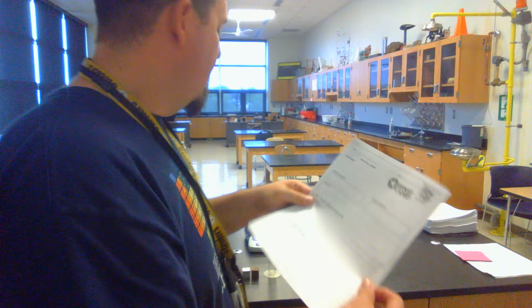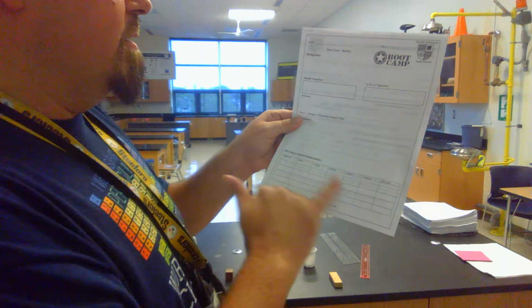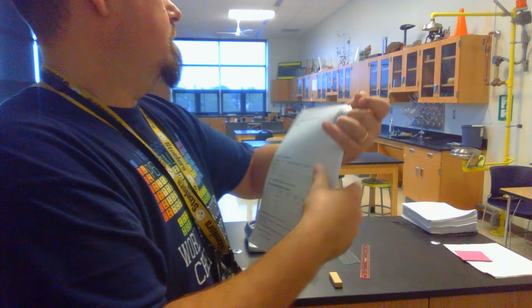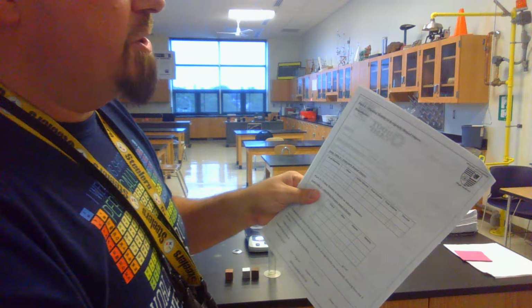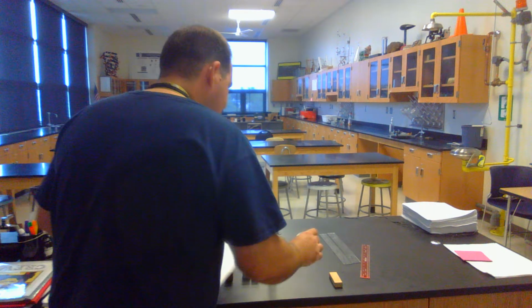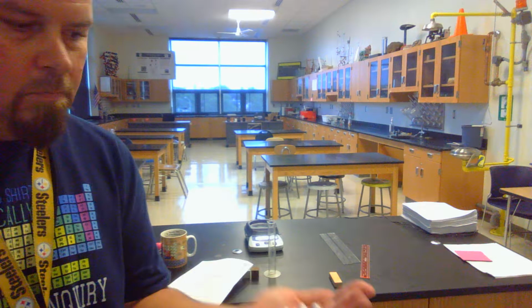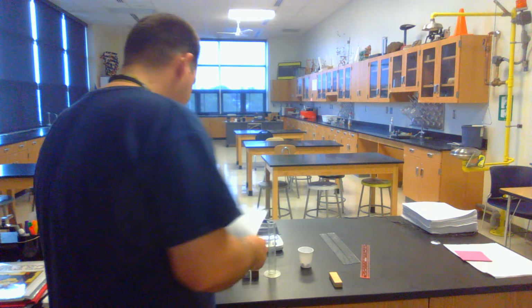So that's basically the procedure, right? You need to get your mass, your length, your width, and crunch your numbers. Then, finding density of an irregular shaped objects. That is going to be marbles, and they're in a cup. White marbles. Okay? So you need to do, again, the same thing.